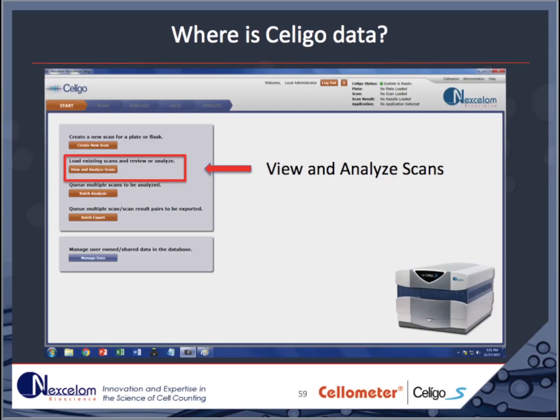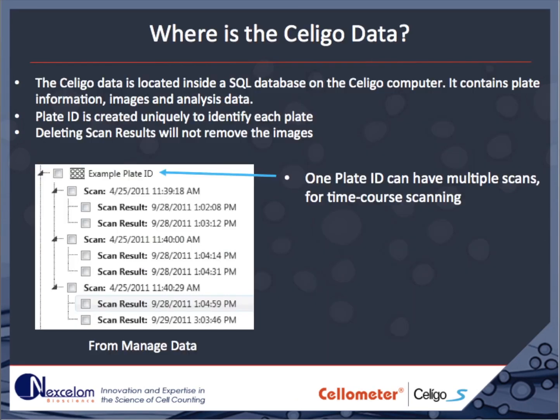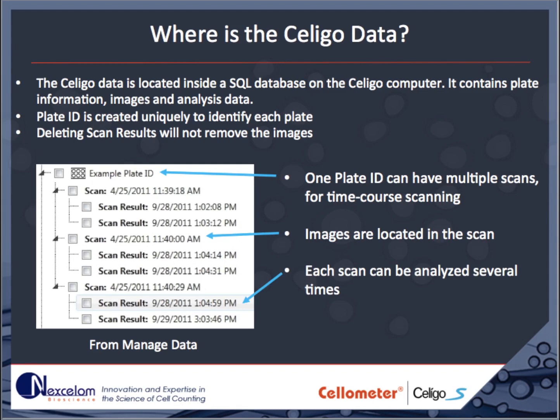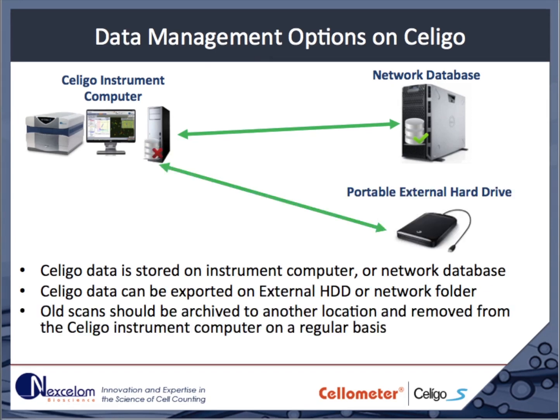All data is stored in the Soligo database. Images and any completed results are automatically saved and can be reviewed at any time. To review or perform additional analysis of any acquired scan, choose View and Analyze Scans from the Start tab. Alternatively, scans can be searched, sorted, and archived through the Manage Data tab. Data is stored on a plate-by-plate basis, with each plate having a unique name. Multiple scans at multiple time points can be associated with each plate, and multiple analyses can be performed on each scan. Data can be stored on a local SQL database or on a network server, and scan data can be exported in an archive format to external disks for long-term storage and backup.